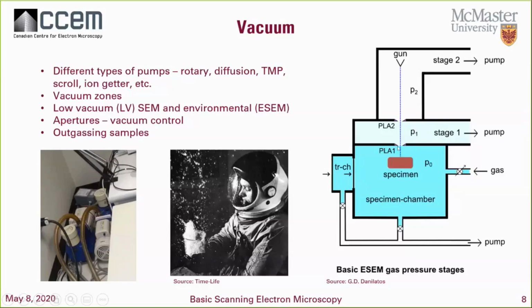So here we have a display showing one of the variations of SEM. So this is from an environmental SEM. So we can actually have various different gases and moisture going into the SEM chamber.